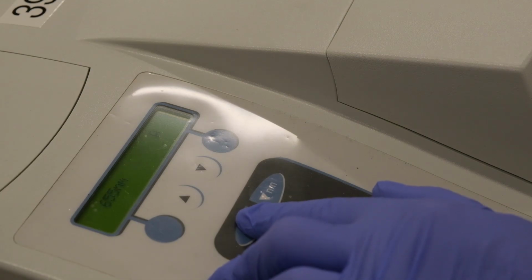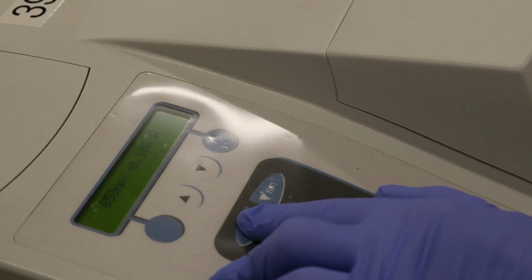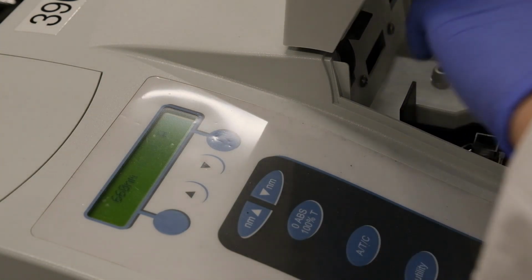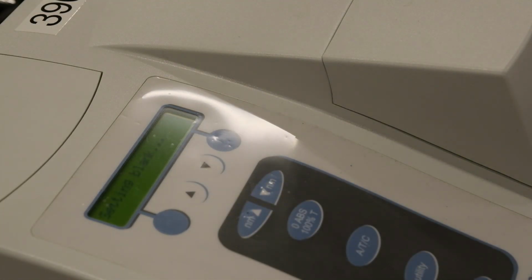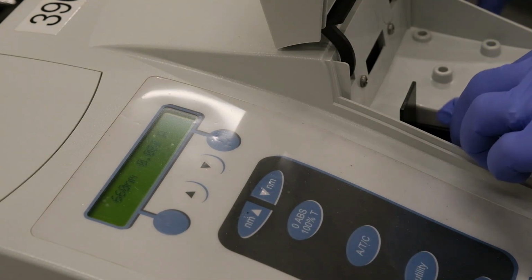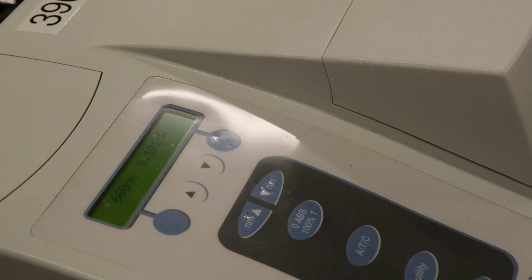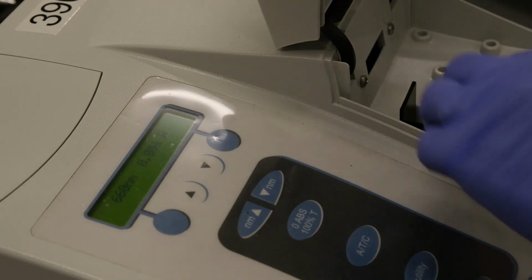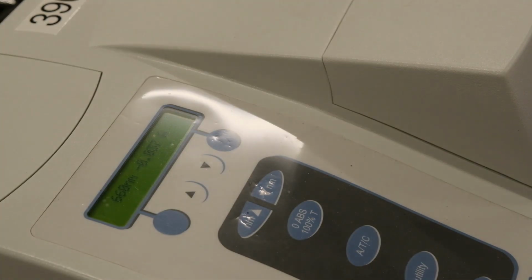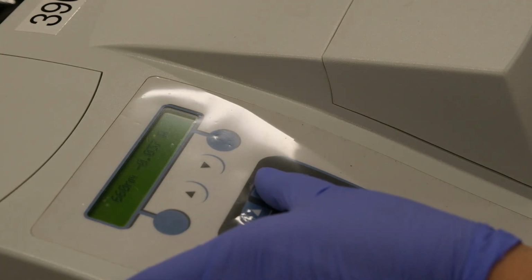And this is our last measurement at 660. So we found the wavelength at which we observed the maximum. We go back to that value.